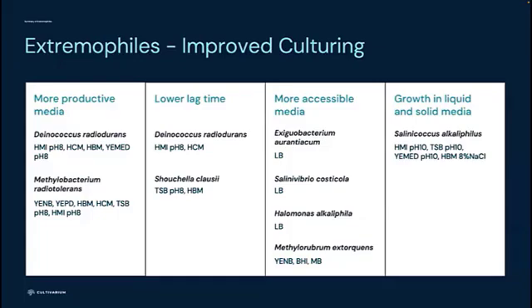For some organisms, we identified a lower lag time and thus a faster growth. We also identified a more accessible media, meaning a less complex media or more common formulation available in any microbiology lab for some of the organisms. And finally, we identified for one organism a media formulation that enabled the growth both in liquid and solid formats.